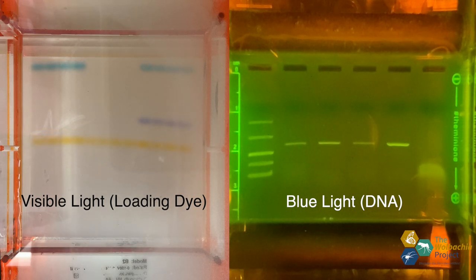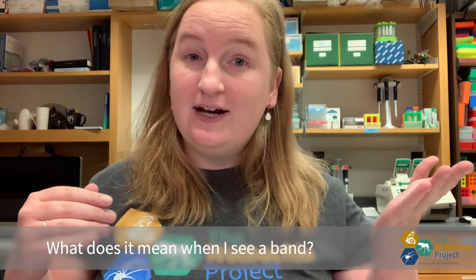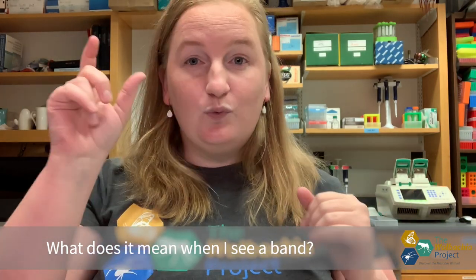What does it mean if you see a fragment of DNA on your gel, called a band? That means your PCR amplified something, and if it's the right size — 438 base pairs or 708 base pairs — it means you amplified either the Wolbachia-specific gene or the arthropod barcoding gene, and it worked. Congratulations! If you have a band at the 438 base pair size, that means you're positive for Wolbachia — you were able to detect Wolbachia in your arthropod.